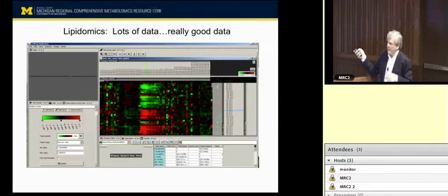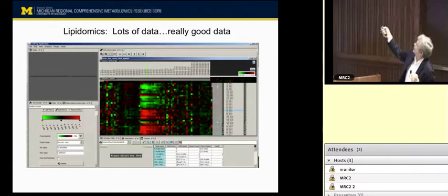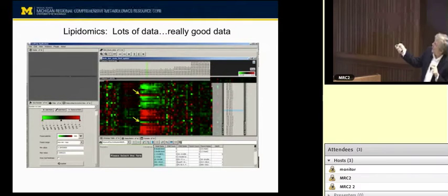One of the things I wanted to point out about why this program was really helpful for us is that these are the control individuals at different days of feeding. And what we found is that there's this outlier here and this outlier here. And they were the same person. We went back and looked at the tube, and it looked like the writing on the tube actually got them backwards. We had independent people take a look at it, and we probably misclassified these two people. Just by visually looking at these data sets, you can see very rapidly that you might have an outlier. Now, this is just going back and looking at it.